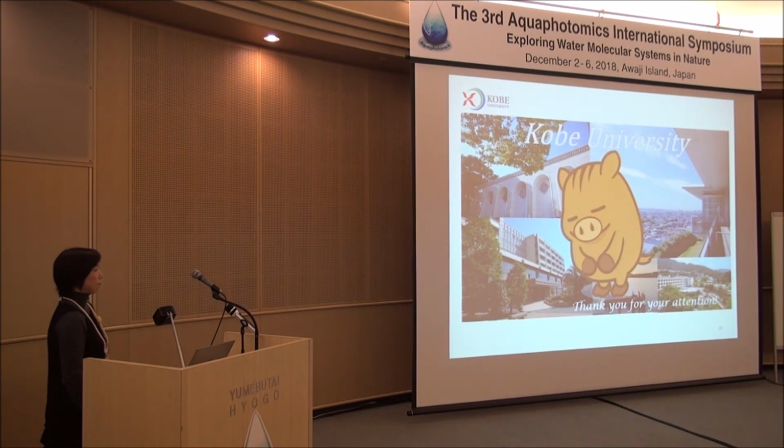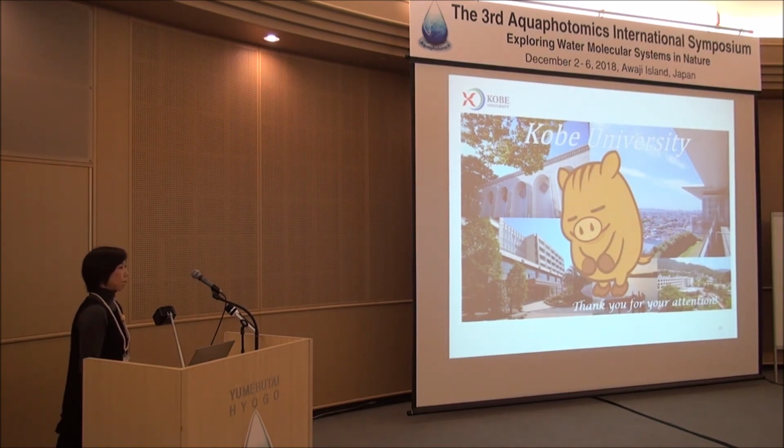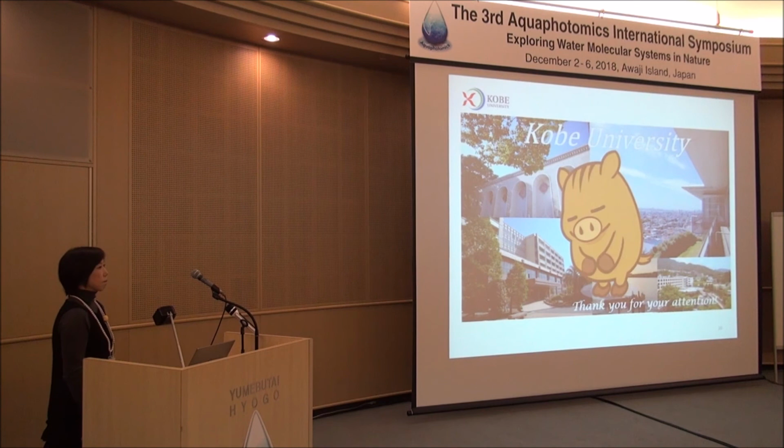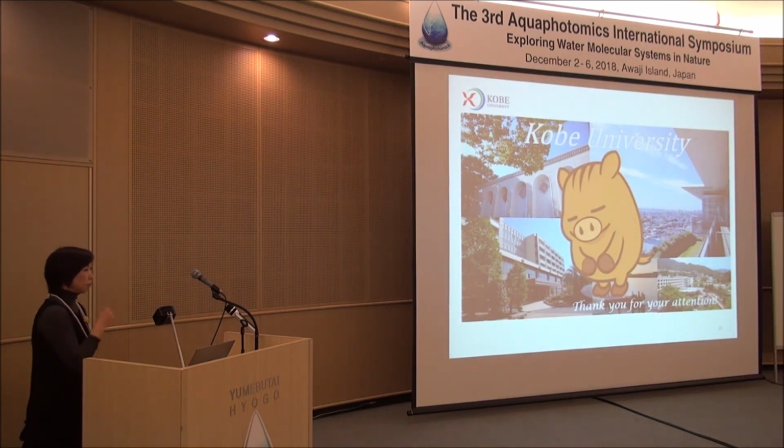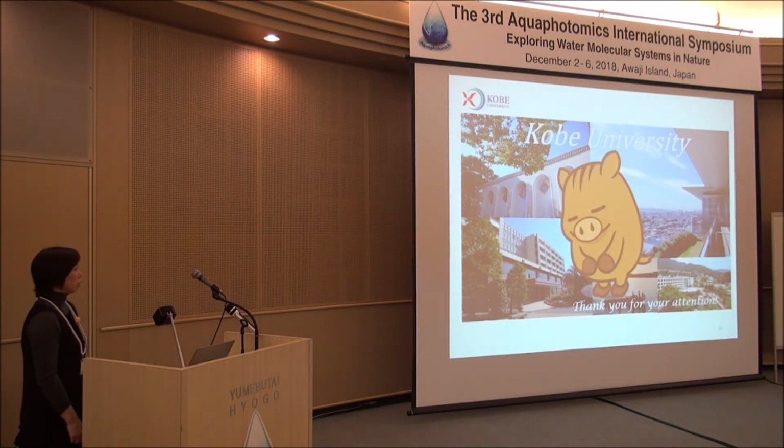But if you do a multivariate analysis, maybe you will see clear positions of those bands. And then we can probably continue and try to see relevance between these bands and similar information from other regions. Yeah, I think so. So we try to.